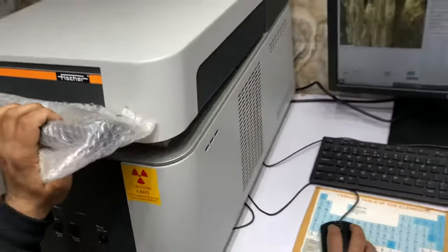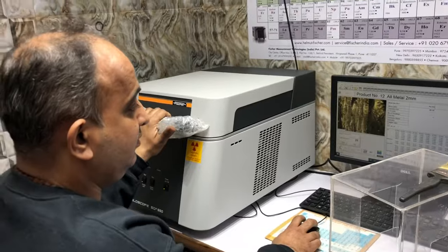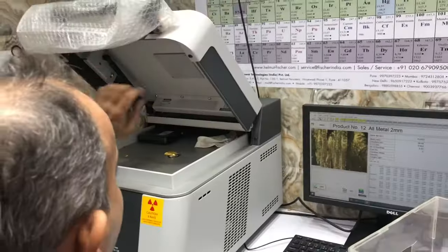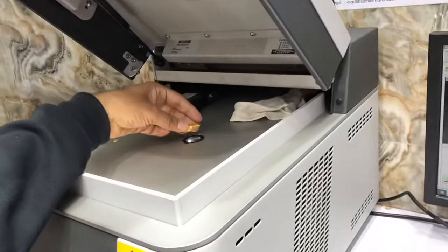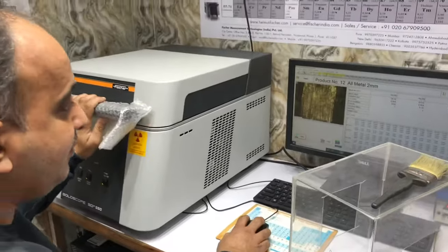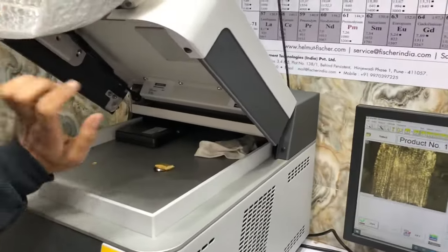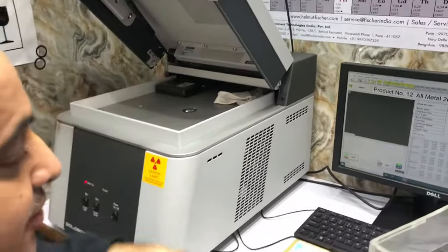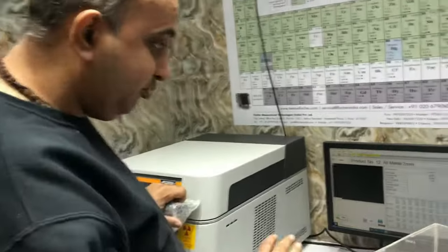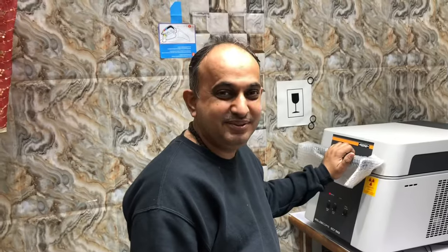It takes one minute time to check. Gold, silver, and platinum — I am going to test all of these.